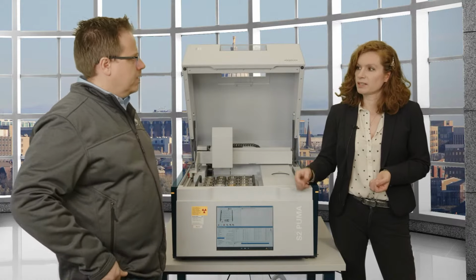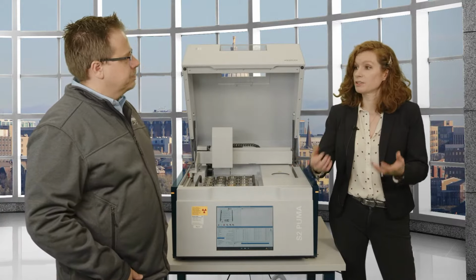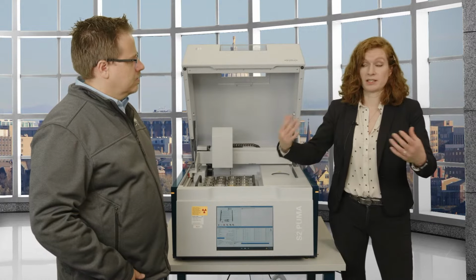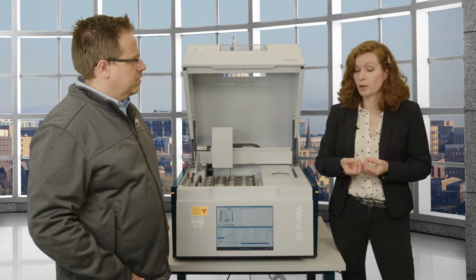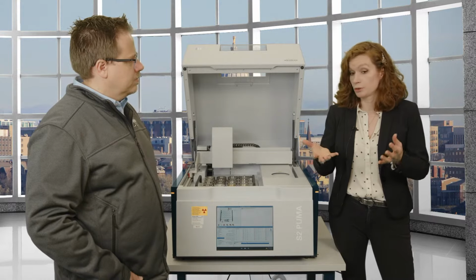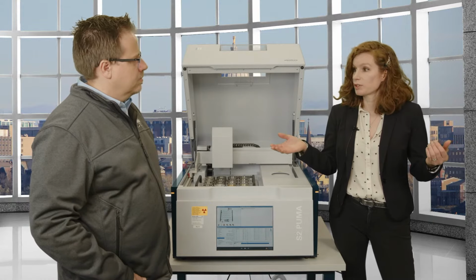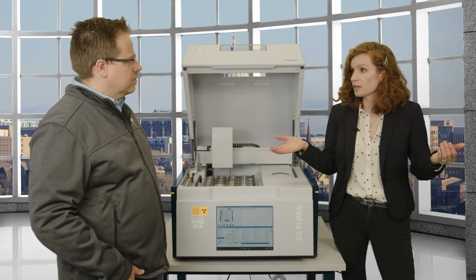Yes, but with the cement kit, these are what we call turnkey solutions. So you get the standards and then you can measure with them. Whereas with the standardless program, you can make adjustments on how you evaluate it. But you don't have access to the standards, because that would be a little bit of an overkill. But if you want to set up a very large range calibration, by all means, get the standards. We will even give you some pointers on how to set it up.